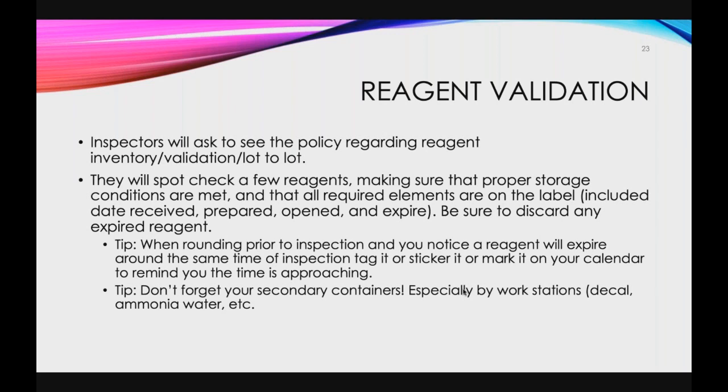Also, big one, don't forget your secondary containers, especially workstations, your decals, your ammonia water. We run AFB and Gram offline because it just doesn't really do well with our special stain instrument. Make sure that anything that's poured off has a label on it and has the GHS pictograms on it.